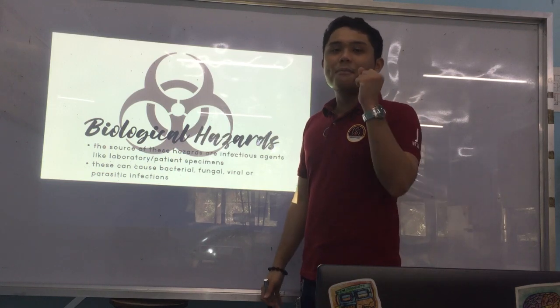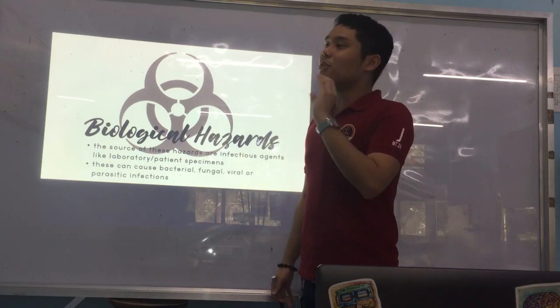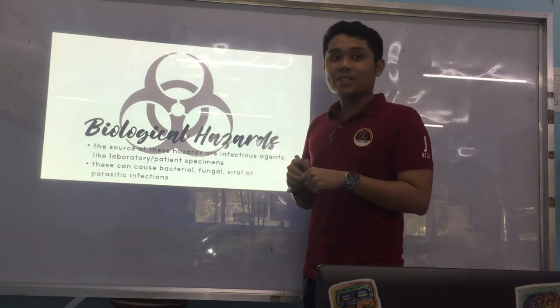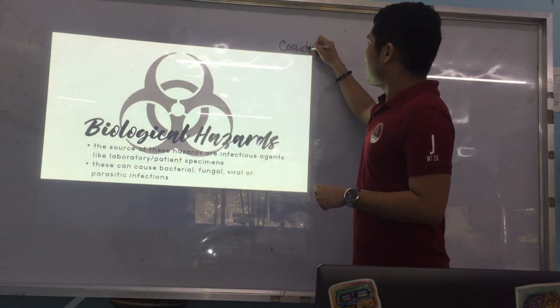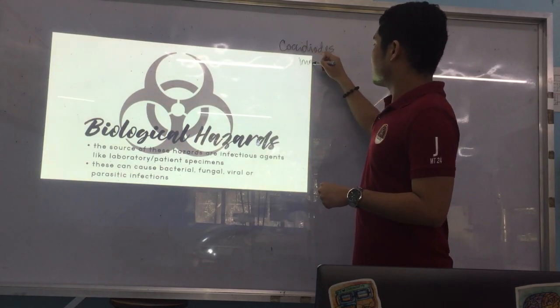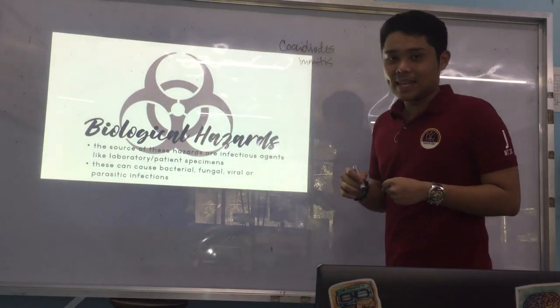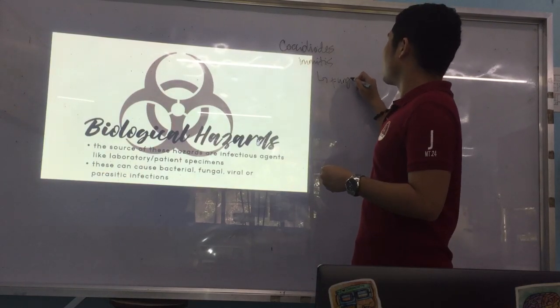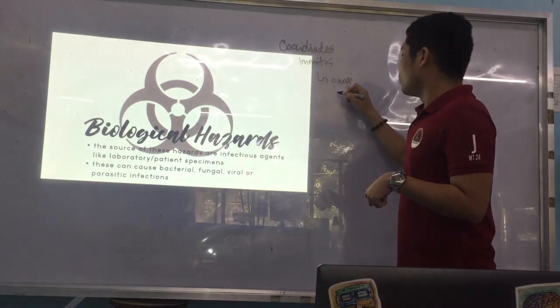What is considered to be the most harmful biological hazard in the laboratory? It is known as Coccidioides immitis. Coccidioides immitis is a fungus — you will encounter this in mycology in the second semester — and it is dimorphic.